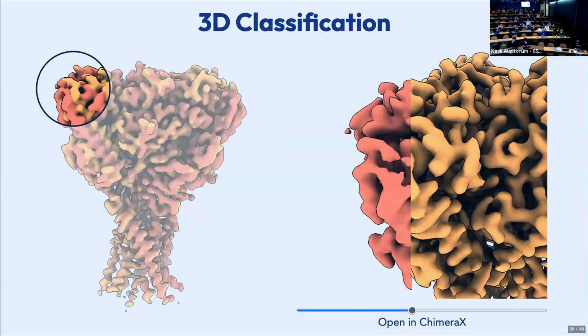Yes, so that's a good point. What's nice about 3D classification is we don't provide an input volume, right? So even though we've imposed the C3 symmetry on the volume during non-uniform refinement, so the particles' poses don't have any preference for one orientation or the other, we're kind of regenerating new volumes for the 3D classification. We just don't impose symmetry on those.